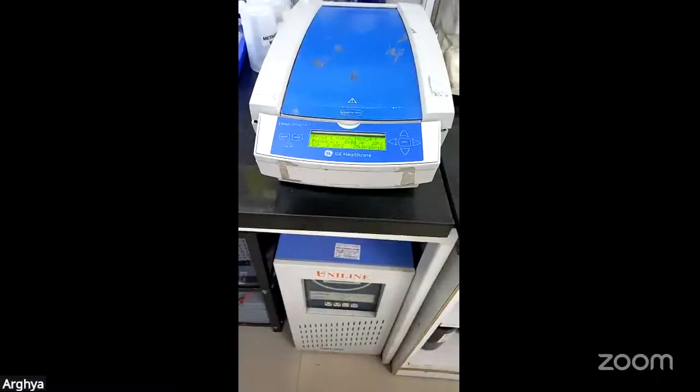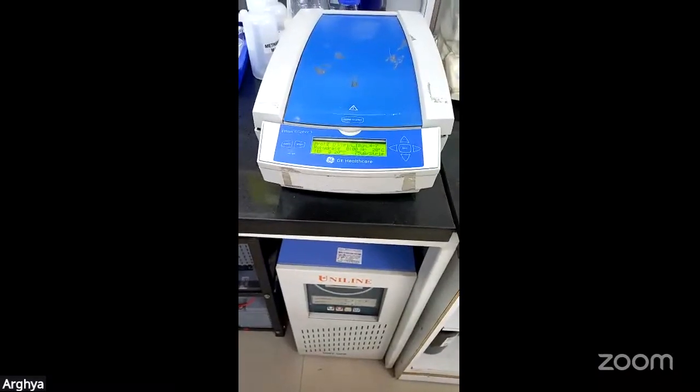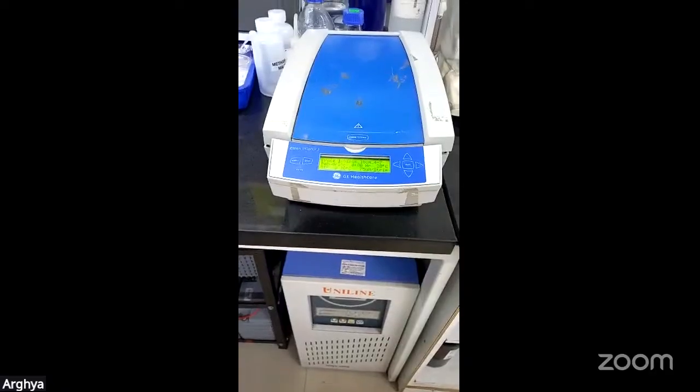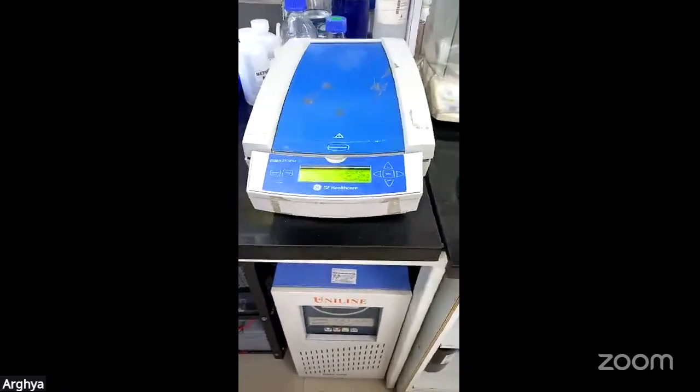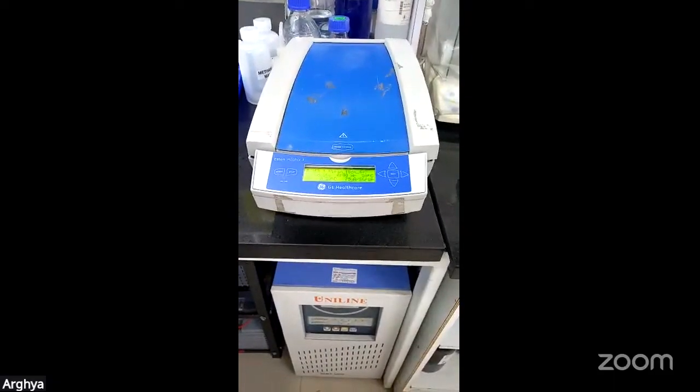But the next thing we're going to talk about is 2D gel, which is next in line, showing in which way you can separate a complex protein mixture based on isoelectric focusing. So now again, the team is going to briefly show you the steps involved in doing 2D. I'll also join in the lab shop.